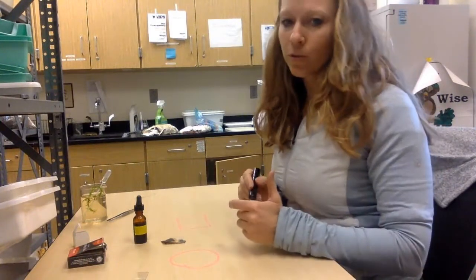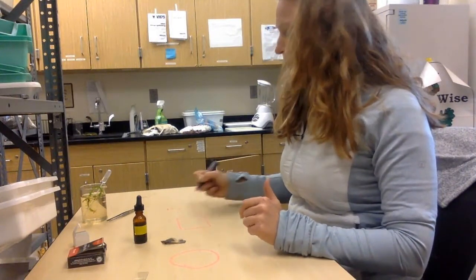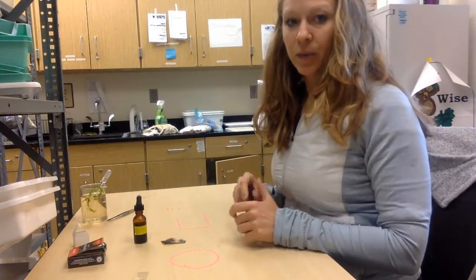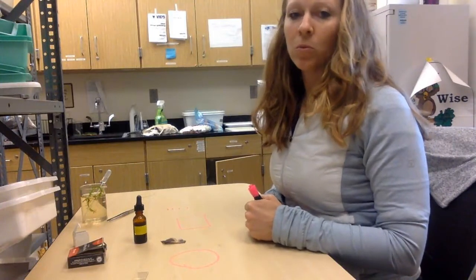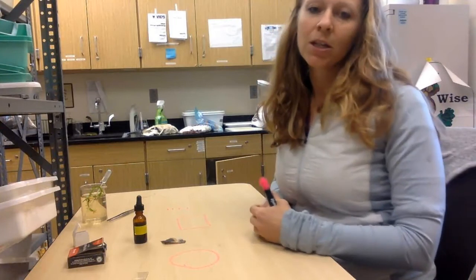So when you draw your field of view, draw those squares, and then make sure you make a list of the things that you're going to be labeling in that section. It'll make your lab go a little bit more smoothly. And if you have any questions, please ask before we get started in the lab. All right.